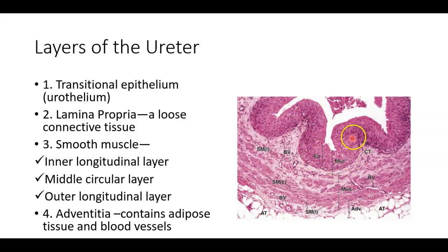This is located in the renal papilla, actually at the end of the collecting duct, renal papilla, then the minor calyces, major calyces, the renal pelvis, the ureter, up to the prostatic part of the urethra at the opening of the ejaculatory duct level. We have the transitional epithelium in male. In female, it goes to the genitourinary membrane level. It covers the urinary bladder, again the ureter, the renal pelvis, the major calyx, minor calyces. So this part lining epithelium should be the transitional epithelium. This is transitional epithelium. Okay.